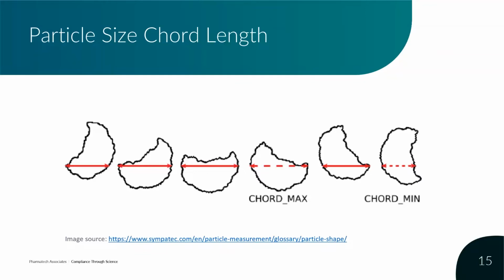And by that, I mean, it is possible to use the characterization of your finished dosage form in order to convince regulatory authorities that you don't have to do dissolution every time. It is a lot of work. It won't work for every product, but the chord length distribution is probably, in my opinion, the most common technique that's used in order to determine a particle size distribution.